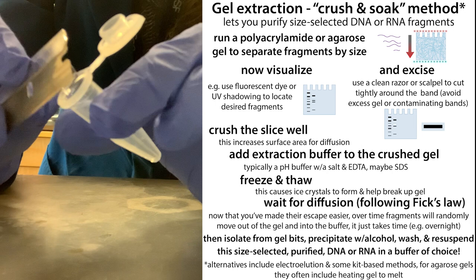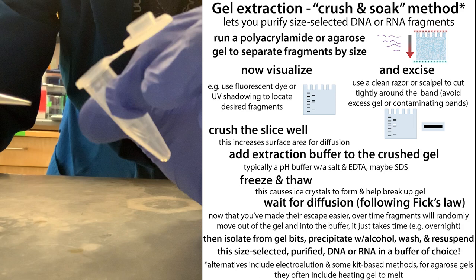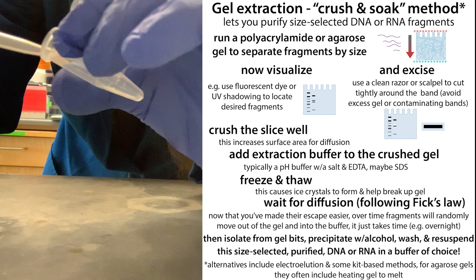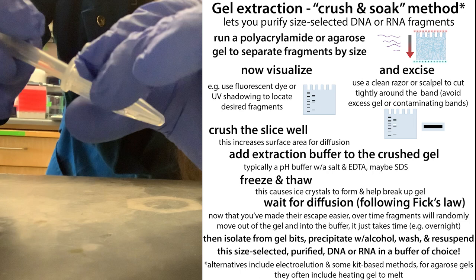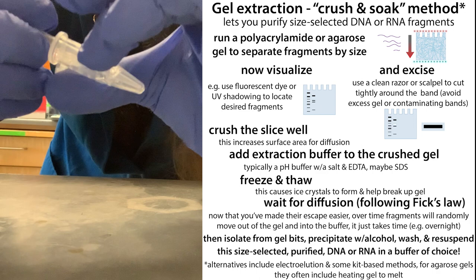Depending on the size of your gel piece, make sure you don't lose any of it, since your nucleic acid is trapped in there. Take your slice from the razor and stick it into a nuclease-free tube. Make sure everything you're using is nuclease-free so you don't have any DNA or RNA-degrading nucleases. Take a nuclease-free sterile tip and get your gel to the bottom of the tube, then use the sides of the pipette tip to crush the gel — don't use the tip end because the hole will get clogged with gel.